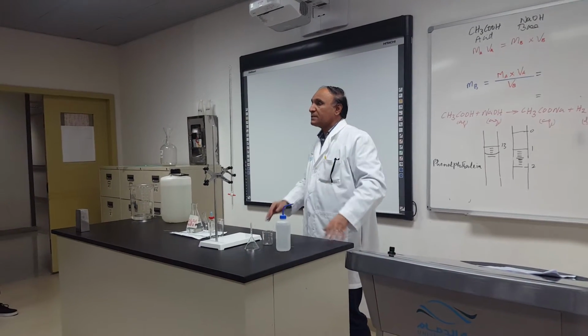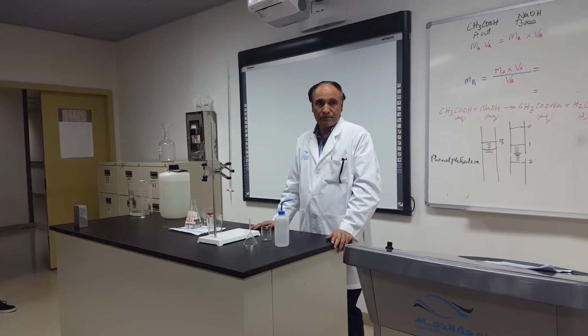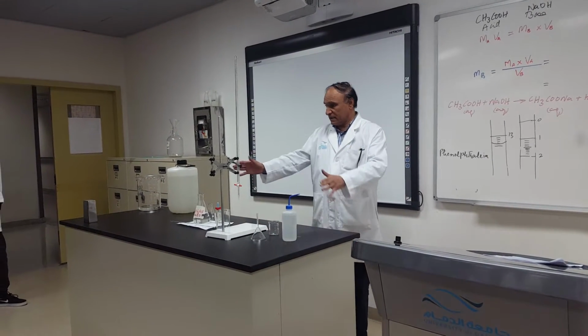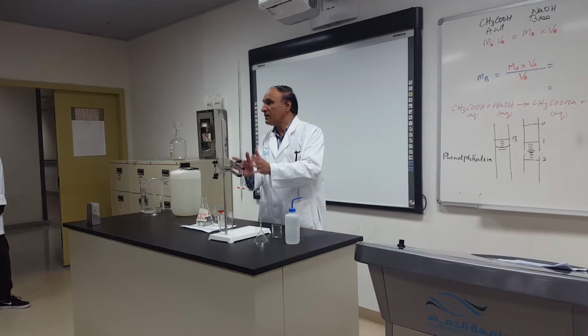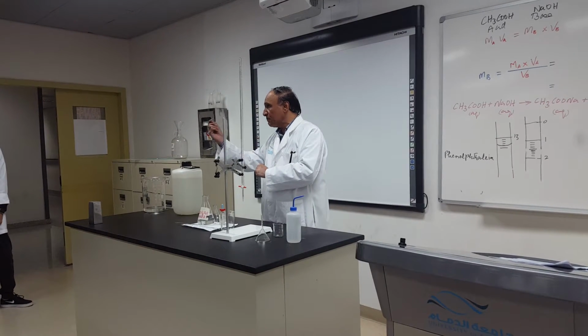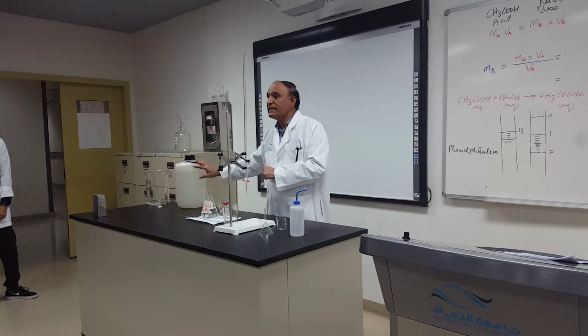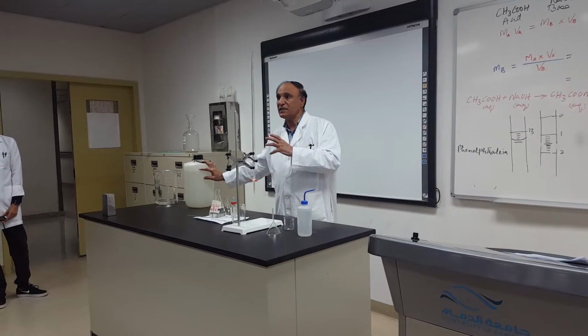The experiment is very simple. There are a variety of experiments in titration, but today I have made one of the simple cases, which is called standardization of a base. Standardization.